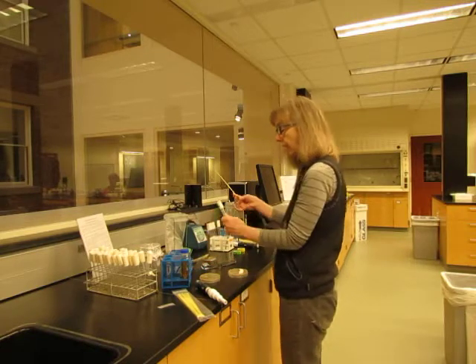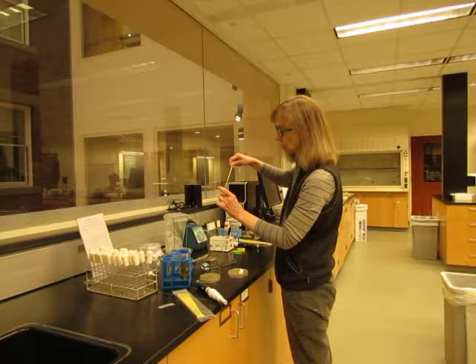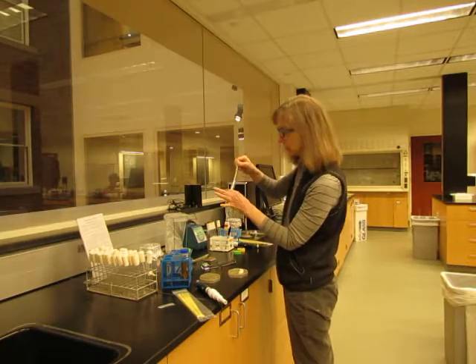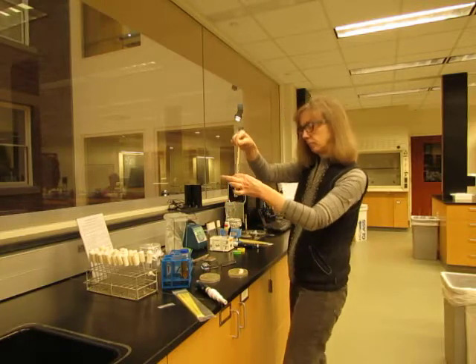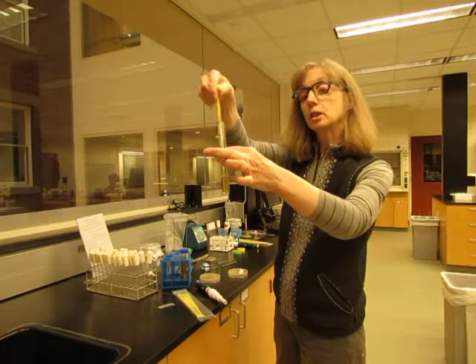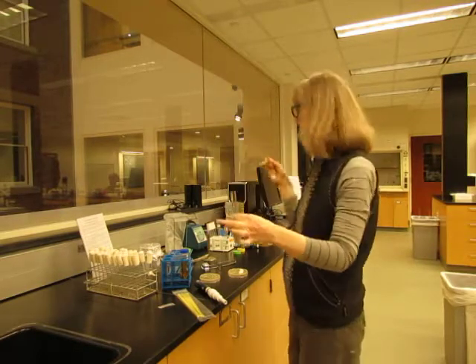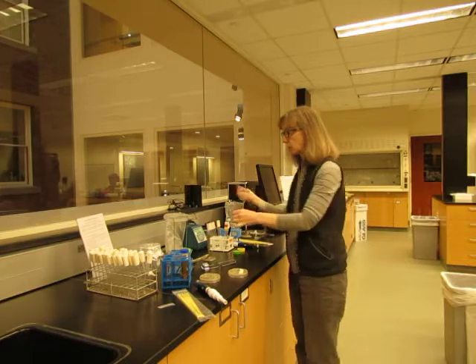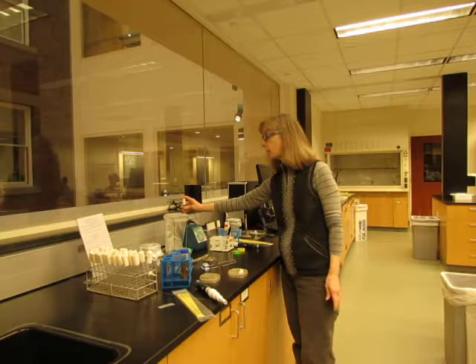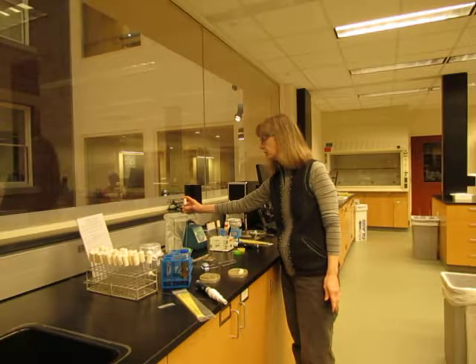Then go back to your test tube that you prepared, briefly flame again, and put the loop down into the media and shake it quite a bit. The colonies are sticky so they don't want to come off the loop. Then that loop is disposed of, flame the top, and vortex to break up the colony. It will grow much better if it's broken up.